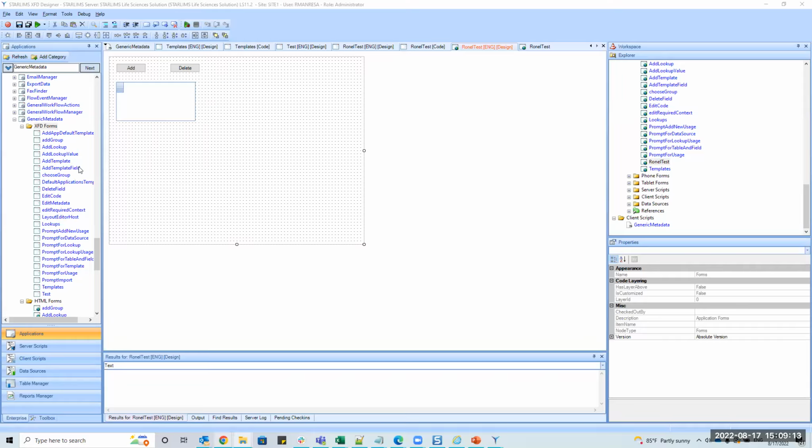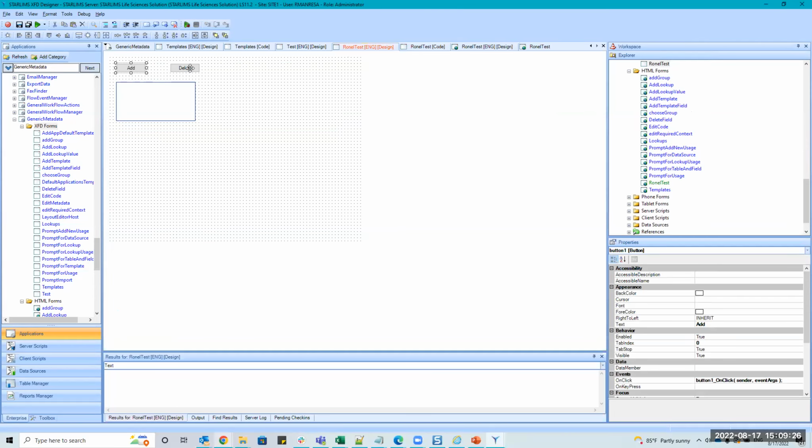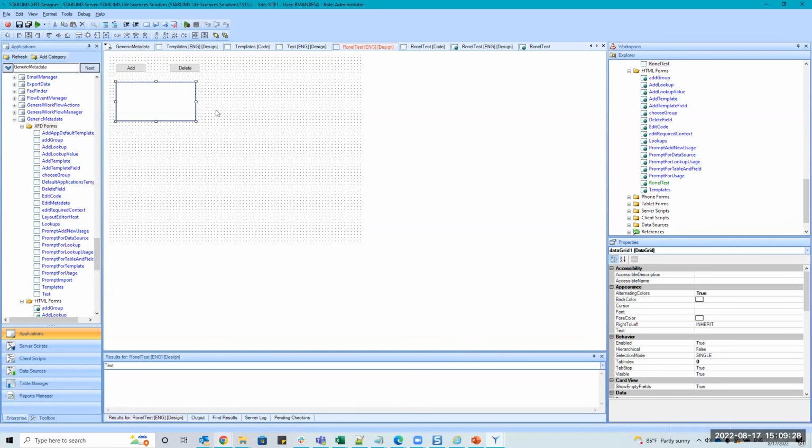This .NET. So that's Microsoft's .NET framework. It's like a framework, right? That allows what we see here, these buttons and this grid, to be rendered. It was really more meant for the old technology, the XFD. You needed to install .NET on the client and on the server.